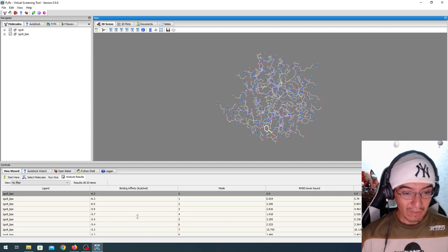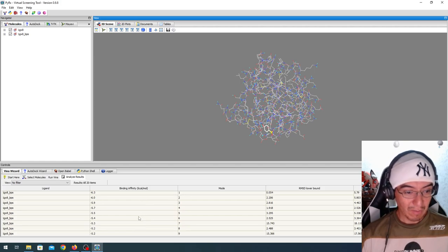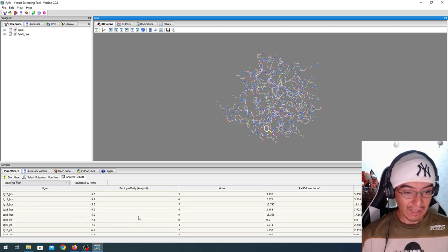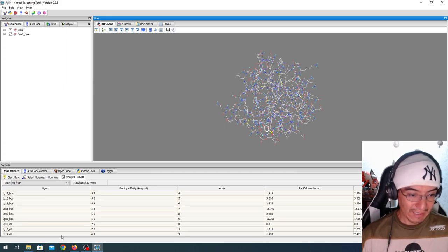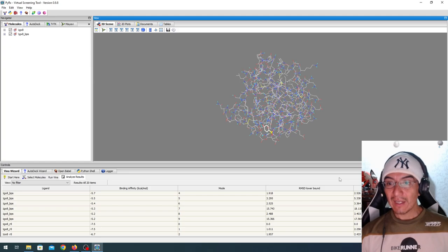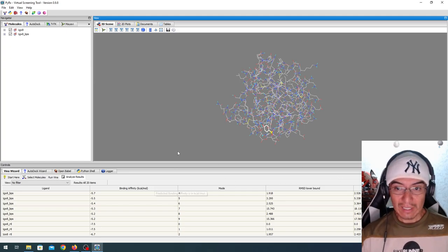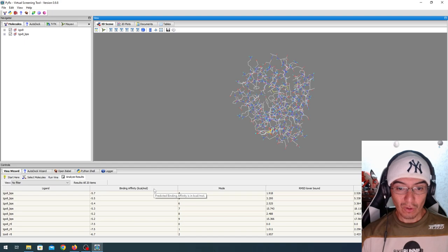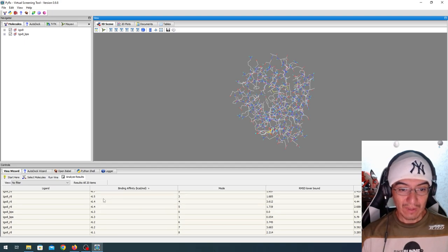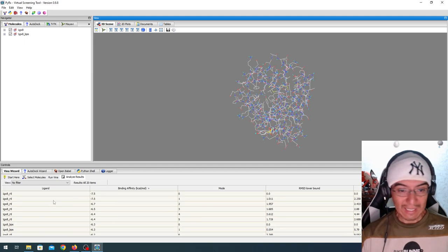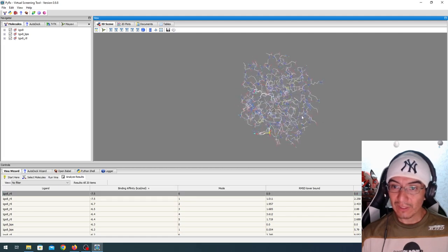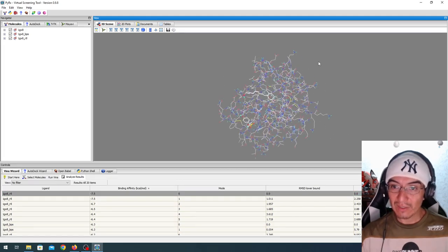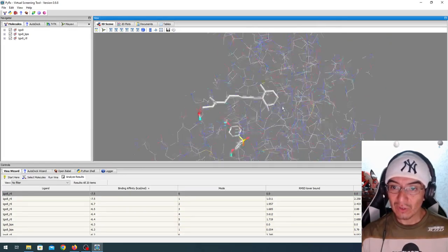And here we have a list of results. Remember, because we selected 10, there's a long list of 10 results for BPS and then 10 for RTL. Within this interface, we can even select the columns and sort them, for example, from the highest affinity in the case of retinoic acid. And here we see the structure of this result.